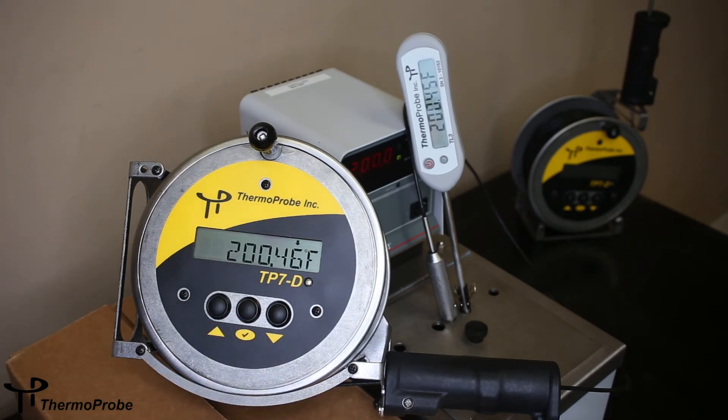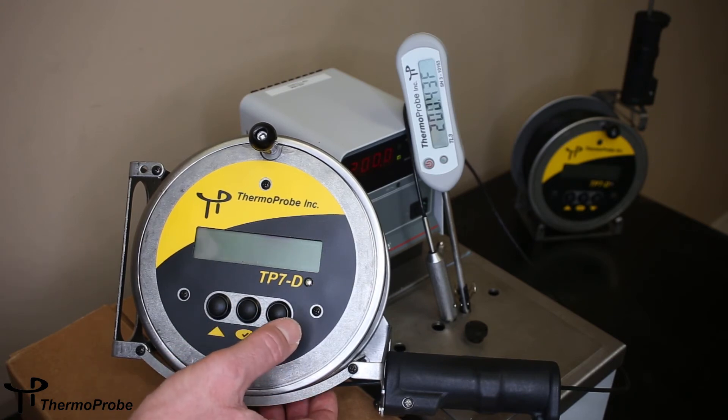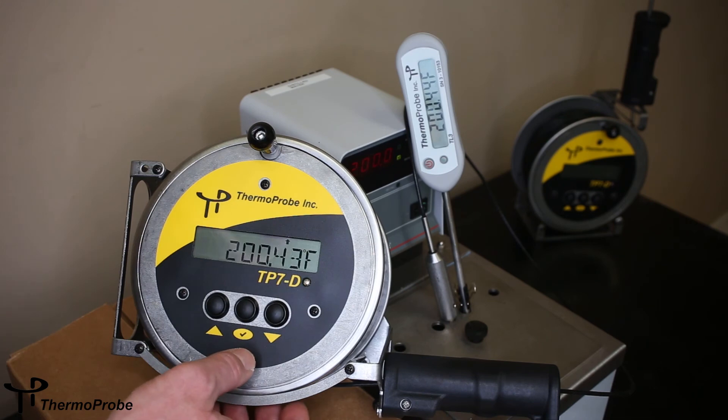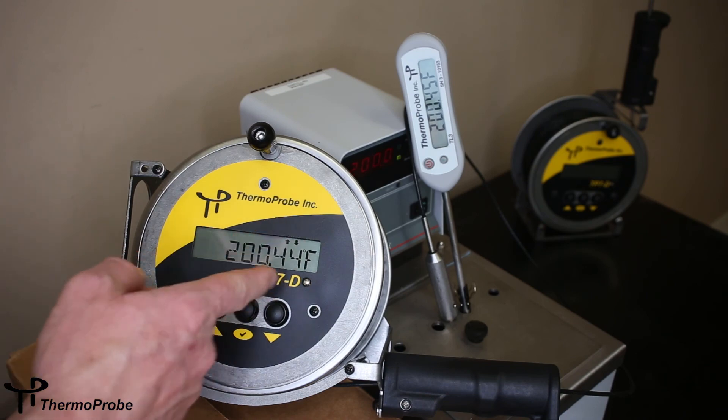We've completed our calibration. To save that, we need to power the instrument off. It's always a good idea to go back and verify that your adjustment still matches your reference at each point it was adjusted. So we're reading 200.43, 200.45, 200.44 — yep, that's good.